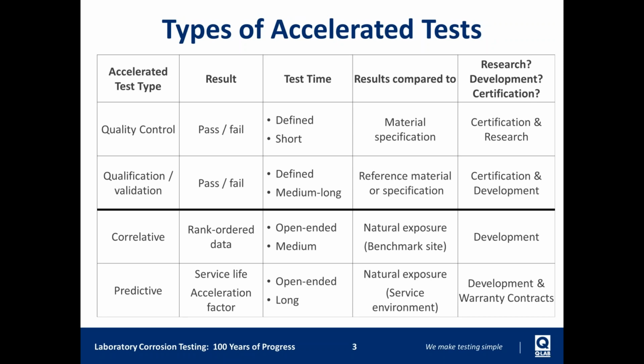The next step of test is what is called a qualification. This is still a pass-fail test, but usually it has more development associated with it. Like an OEM or maybe an industry group has come up with a set of standards that you need to meet. But it's similar to a quality control test because you're not actually comparing things to outdoors. But what this does give you is an opening to development, because if you know that this is the minimum requirement to meet something, that can be used in the development of new formulas.